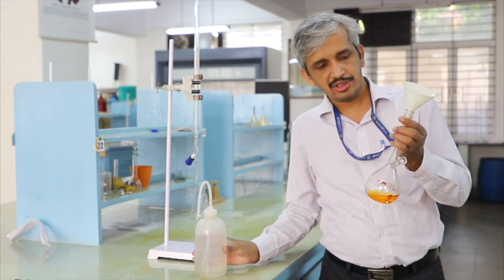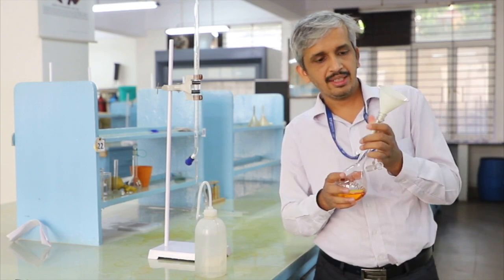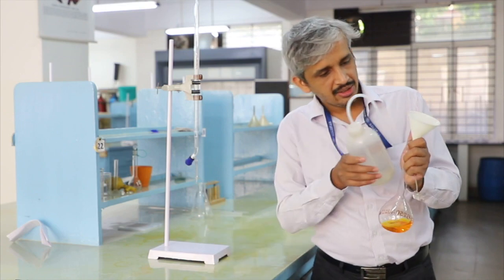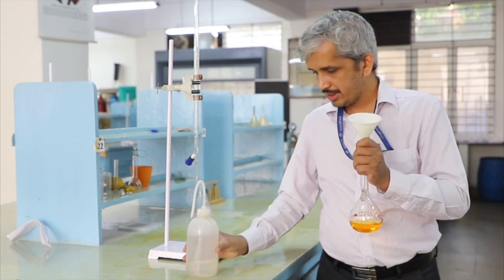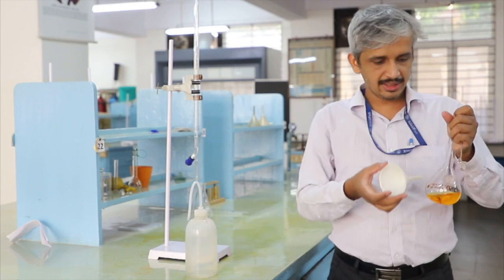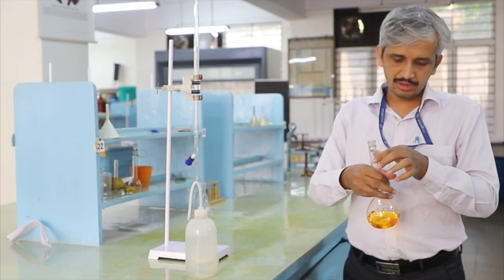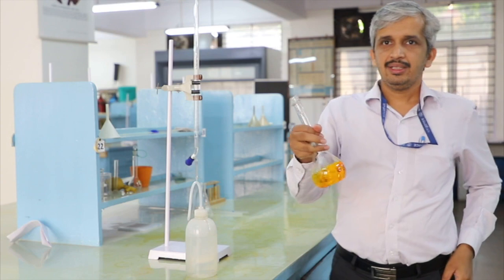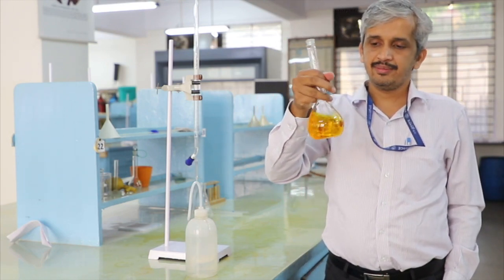Also, there may be some crystals sticking to the tip of the funnel. To avoid that, you have to wash it from inside like this. Overall you have to make sure that no crystal is wasted. Everything is now inside this standard flask, and now I am going to dissolve this carefully by gently shaking this solution.